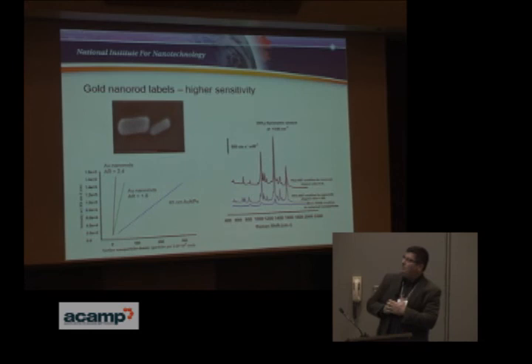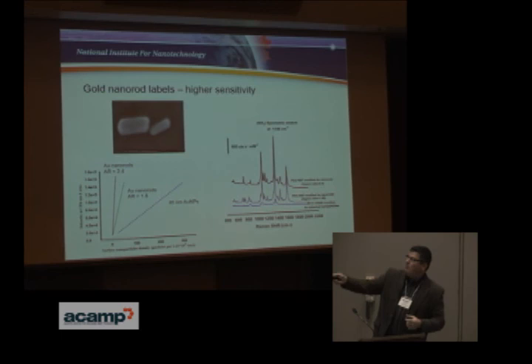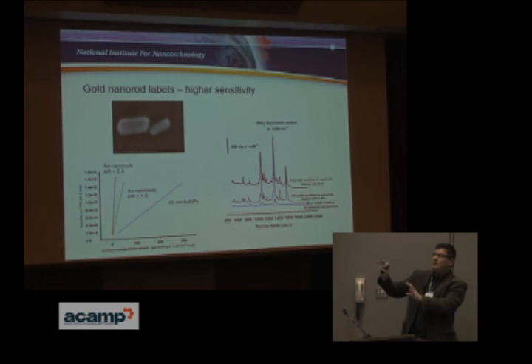And this gives you just an indication of how much more sensitive the rods are relative to the spherical particles. These are three different spectra. The top two are for nanorods with different aspect ratios, just different sizes of nanorods. The blue spectrum on the bottom are the spherical nanoparticles. And as far as we can control it, the amount of nanoparticles in this assay, the conditions are very similar. And so we're kind of comparing apples to apples here.